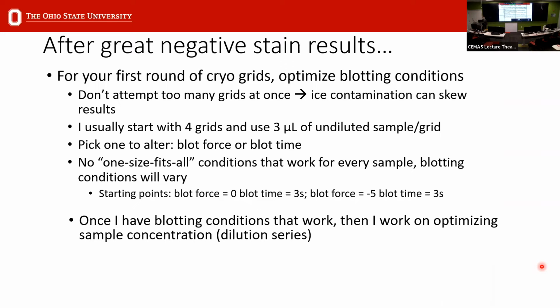Once I have blotting conditions that work, then I focus on optimizing my actual sample. So the main thing I try to optimize next is concentration, and then later down the road, sample behavior.